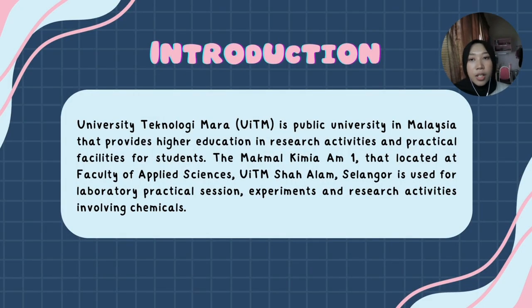For the introduction, I would like to introduce the organization and workplace involved in the chemical health risk assessment. The workplace selected for this assessment was Makmal Kimia Am1, located at the Faculty of Applied Science, UiTM Shah Alam. This laboratory is used for teaching, practical experiments and research activity that involve chemicals. The laboratory allows students to apply their theoretical knowledge and develop their practical skills through chemical handling activities.